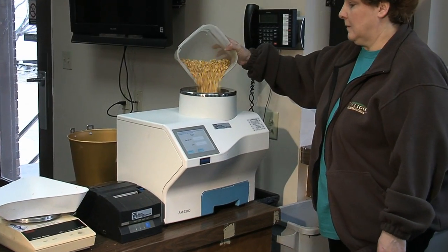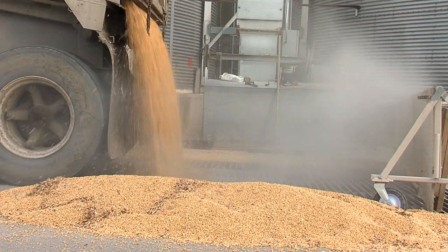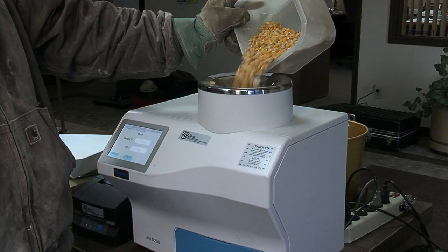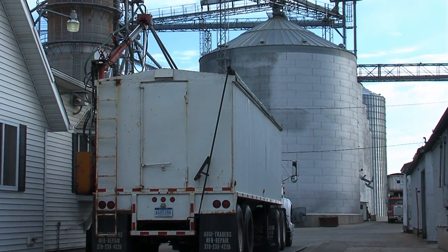Beginning in the fall of 2012, the USDA, many of its official agencies, and many grain elevators will be using the Purtin AM5200A to measure grain moisture and test weight for every load that crosses their scales.